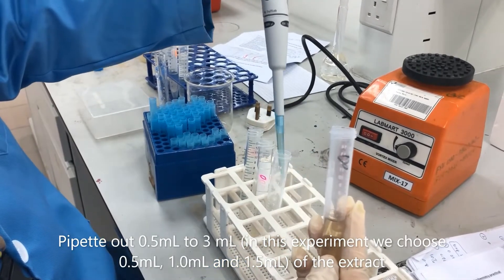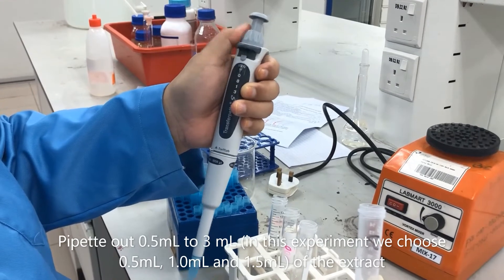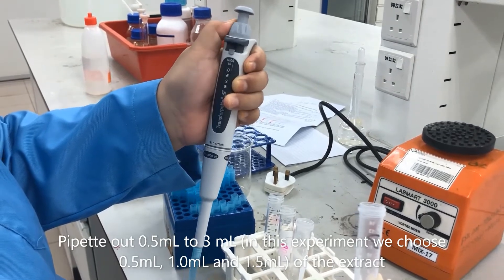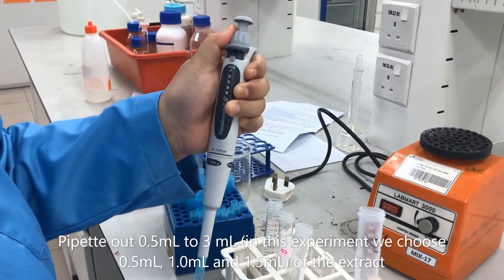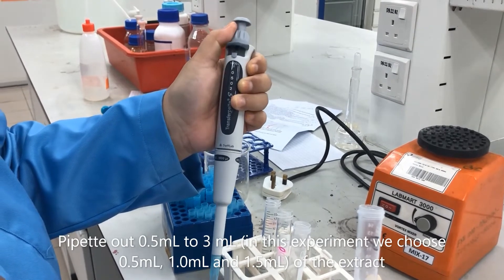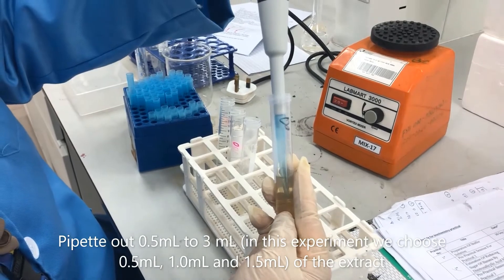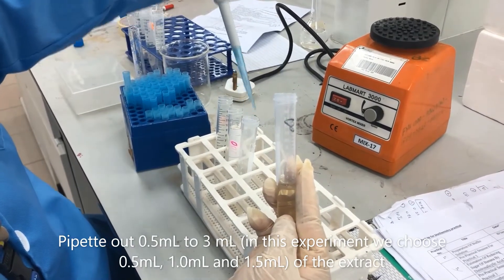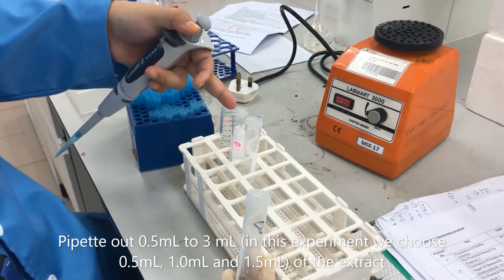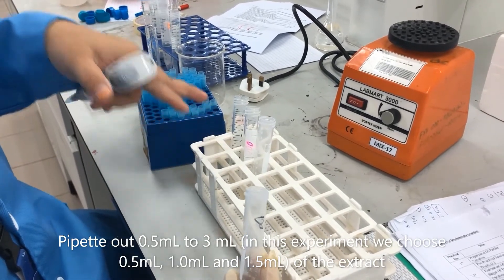1.5ml — so this is 1ml, and then we change to a 500µl pipette to get 0.5ml of the extract. So 0.5ml for the first tube. So here we get 0.5ml, 0.5ml, 1ml, and 1.5ml. Later we will equalize to 3ml for all tubes.